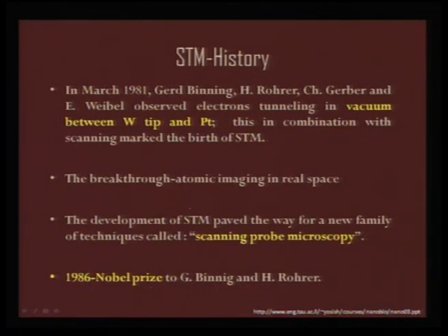And so, the path-breaking discovery led to atomic imaging in real space, and not only that, the STM paved the way to a new family of techniques called scanning probe microscopy. SPM is the normal way the microscopy is referred to, but it can also accommodate various other tunneling microscopic techniques.